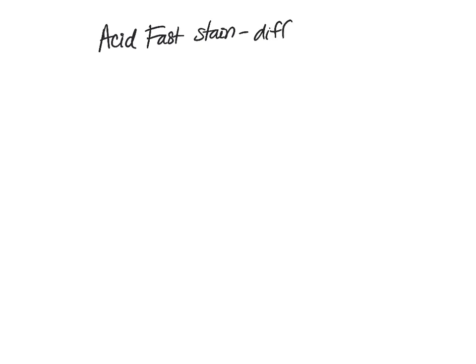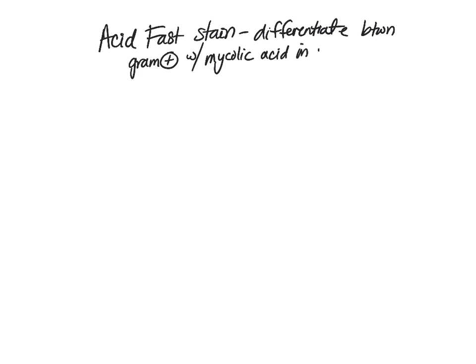Remember, this is a differential stain. So it differentiates between gram-positives with mycolic acid in the cell wall versus gram-positives without the mycolic acid.